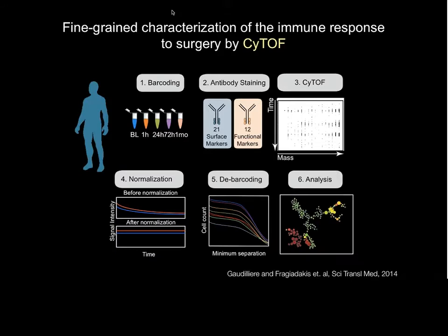Along with our profiling of the immune responses, we of course were tracking recovery time. Before I get into the full data that we profiled for recovery time, I just want to show that we were indeed seeing this pattern of a wide range of recovery time.